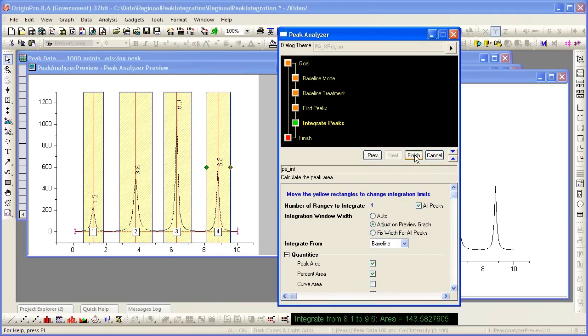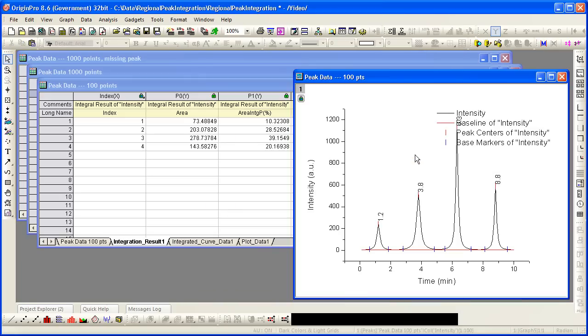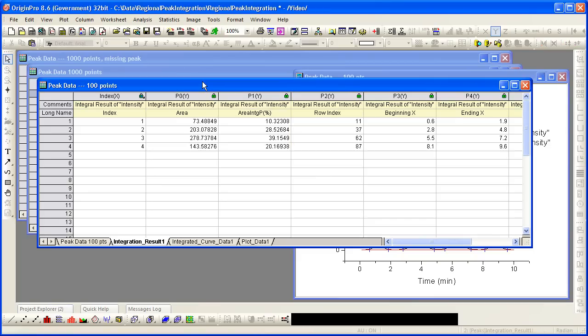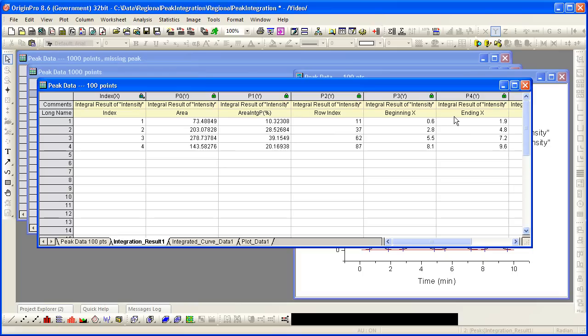Now I can select finish to complete the analysis. Notice that I get a result with four peak areas, row indices, beginning and ending x values, etc. as I stipulated in the PA output.